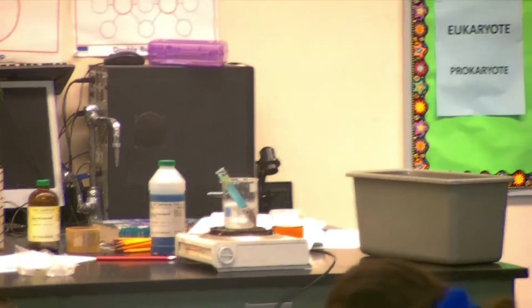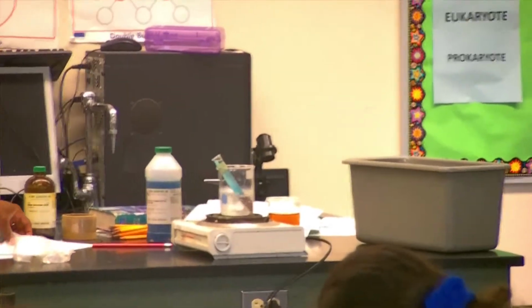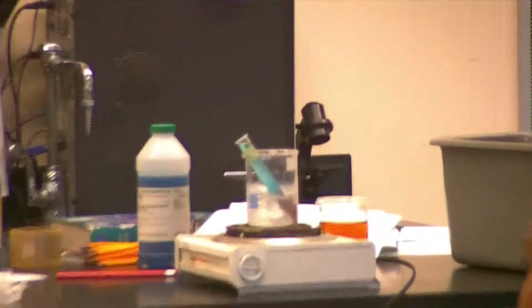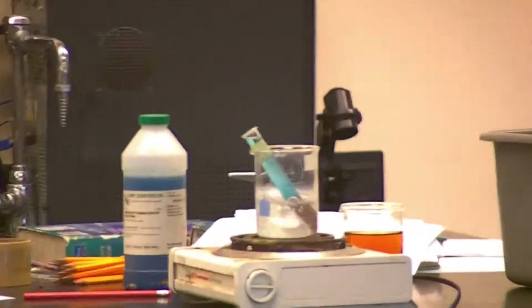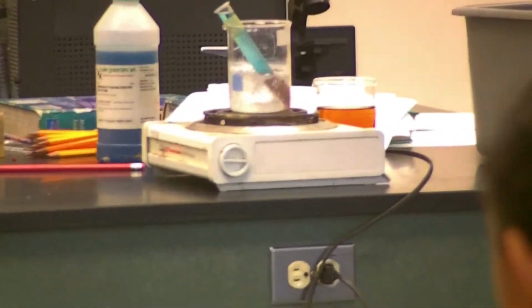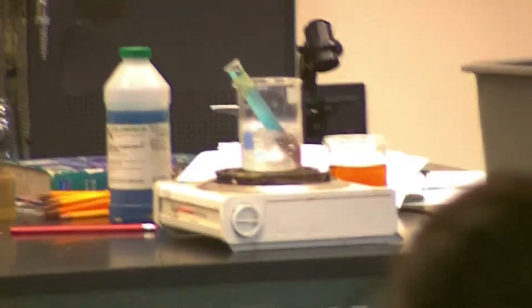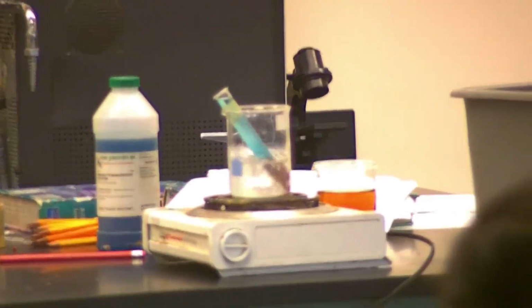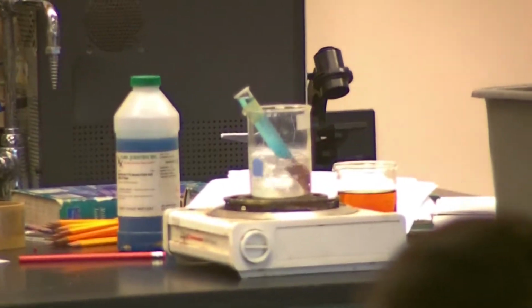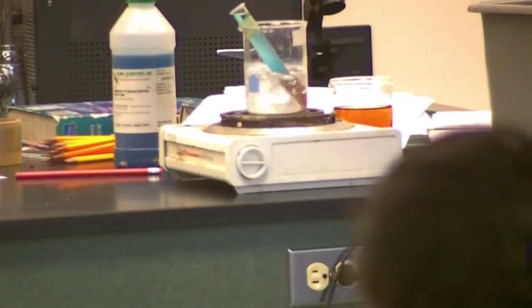So let's kind of recap this. We're looking at the second column over where it says, did a molecule diffuse across the membrane? So let's look at iodine. Did iodine diffuse across the membrane? Yes. What was our evidence? The starch inside turned black.